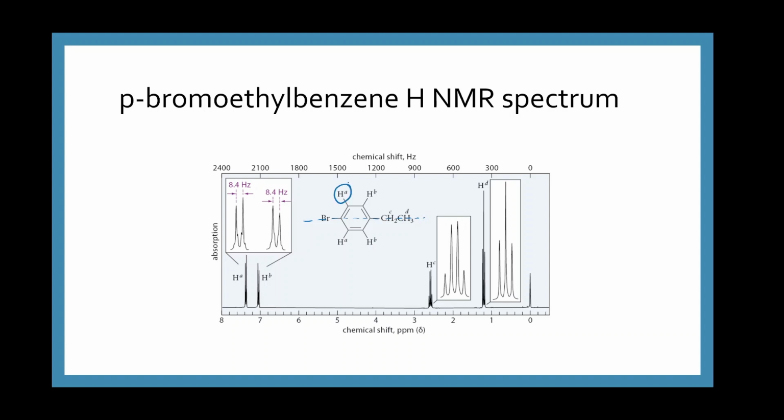So notice that this hydrogen is labeled as HA, and so is this one. These are in the exact same chemical environments. They're bonded to a carbon that's bonded to a carbon that's bonded to a bromine. And then if you look in the other direction around the ring, we've got the exact same bonding pattern. So they're in the same chemical environment. They show up as the same peak. Here is the HA peak. That's in the area of aromatic carbon to hydrogen bonds, if you look at the table with different chemical shifts for different functional groups.